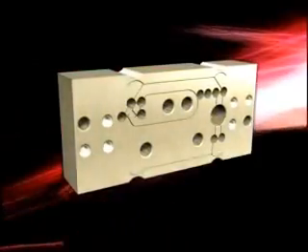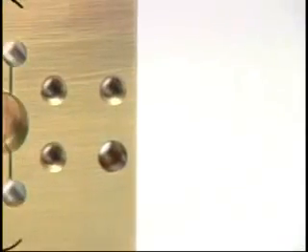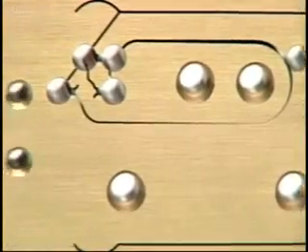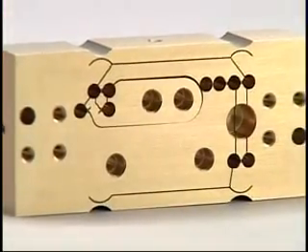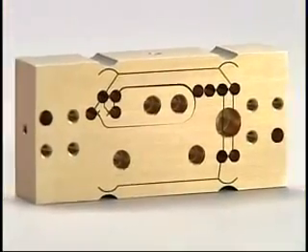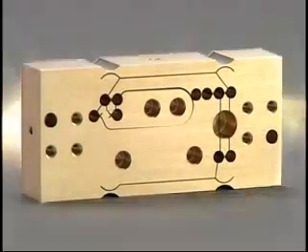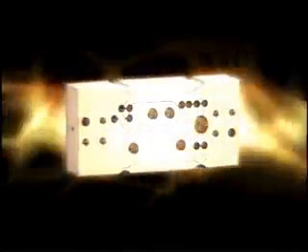The secret behind this strength is the UniBlock, a new generation mass sensor built right into the balance. This block of aluminum alloy is the new generation UniBlock mass sensor. UniBlock — a testimony to high-end technology.